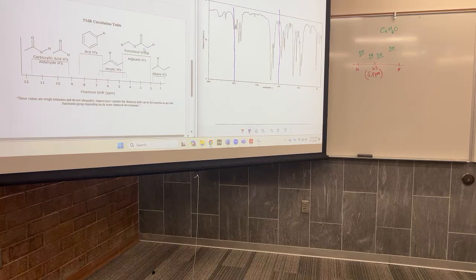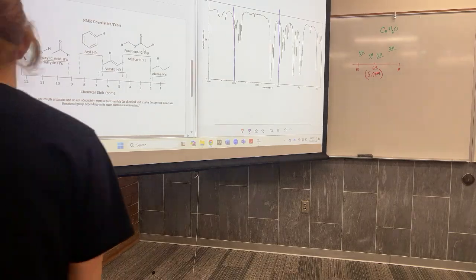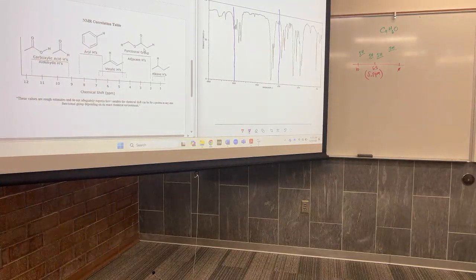No, this isn't it. Notice that you have no hydrogen that produces a signal close to 10. The only thing that produces a signal close to 10 are these hydrogens. Oh, I see. Yeah, how would you know? I don't know. Oh yeah, maybe. That's a good idea actually. You could assume that, yeah. I forgot you could do that.